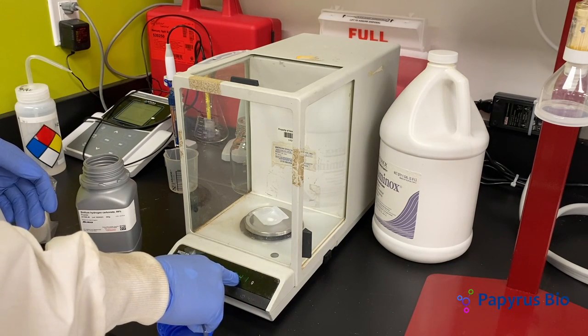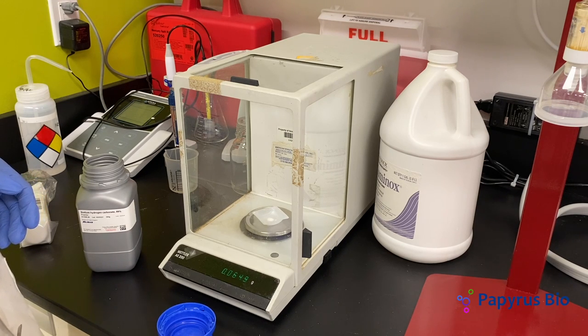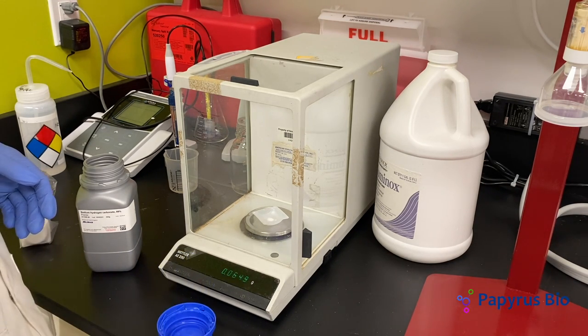Wait for the scale to stabilize. The mass of the sample is approximately 65 milligrams.